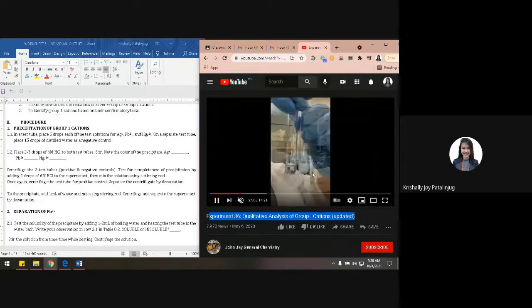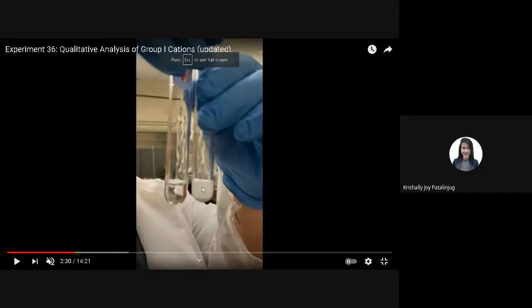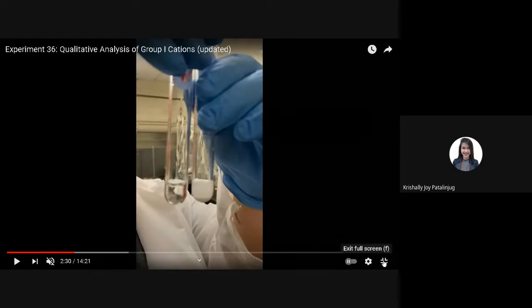Sige. So, next step. This is just the precipitate. Ito yung precipitate kanina. Precipitate na nilagyan ng water. Okay? Nilagyan na siya ng water para may solution ulit tayo. May solution ulit tayo for testing. Ito, negative control lang po ito. Meaning walang reaction na mangyayari dyan sa negative control.